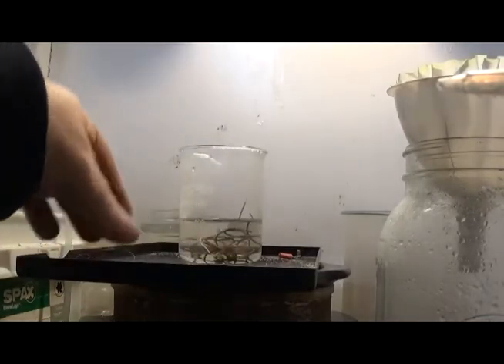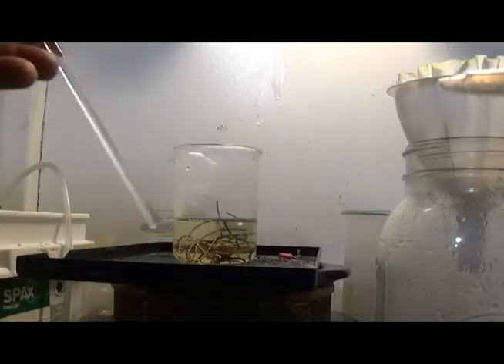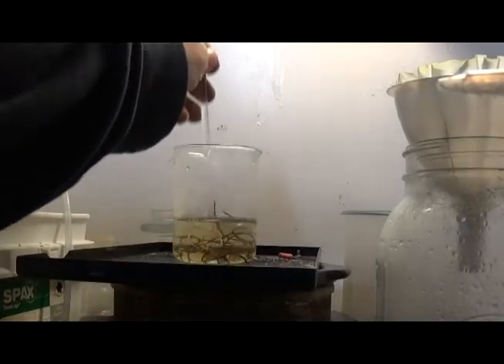Alright, good — it's not reacting violently. That is what I want to see right there. It's already becoming — it's supposed to turn that color, and it's only supposed to get darker. So that is good news. And it didn't fizz over into an exploding pile of goo. Winner, winner, chicken dinner so far.